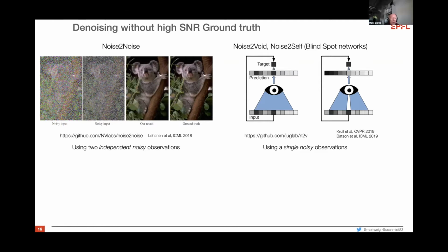Yeah, it was more about the philosophical, or philosophical is a big word, whether you should add noise to an image and try to model the noise you get and then add more of it, or is fixing and then having a good resolution image the better strategy?